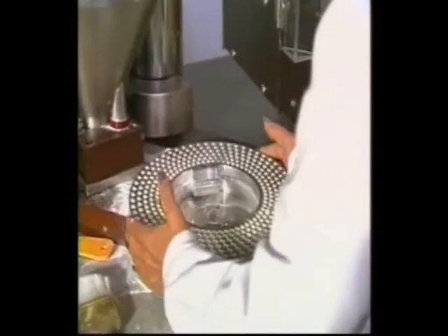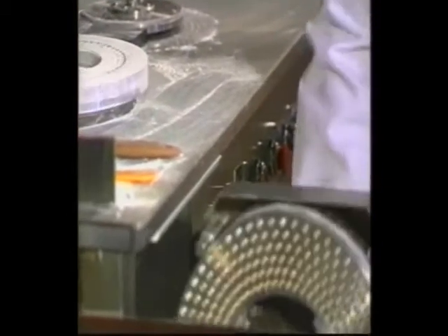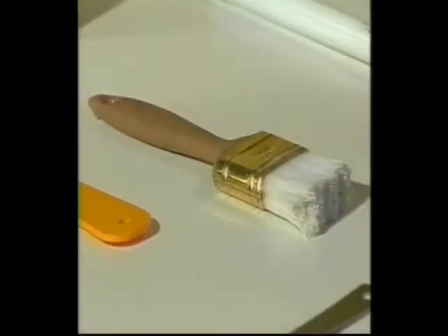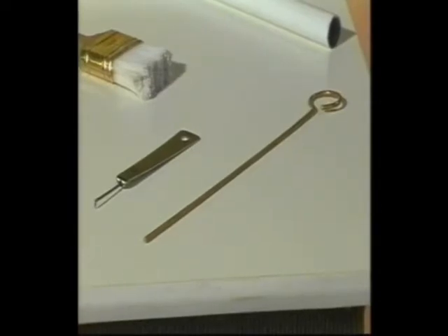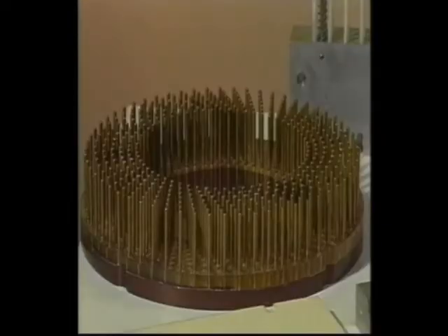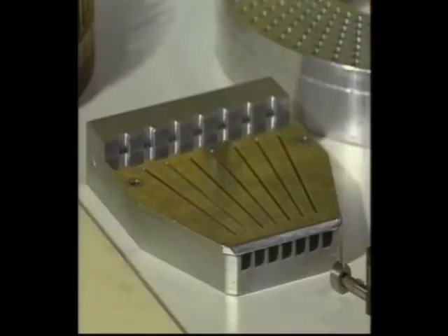As you acquire more experience operating the Model 10, you'll find you can have one, two, even three rings on your table at the same time. When you order your Model 10, you will receive an operations manual, a set of Allen wrenches, a soft bristle brush for cleaning your workstation table, a brass rod and a pick to clear out capsule jams, and a jack handle. You will receive one size-specific set of parts. To run additional capsule sizes, you will need their corresponding parts, called change sets, which can be ordered separately.